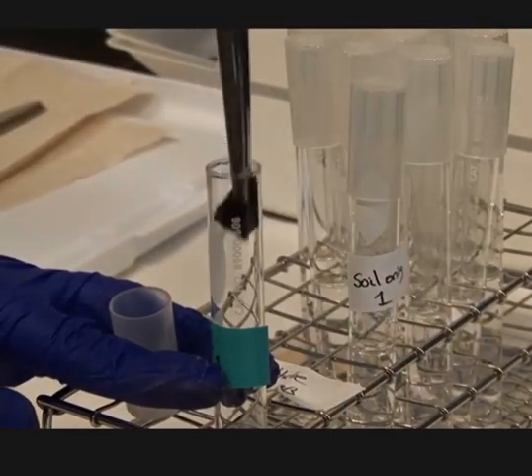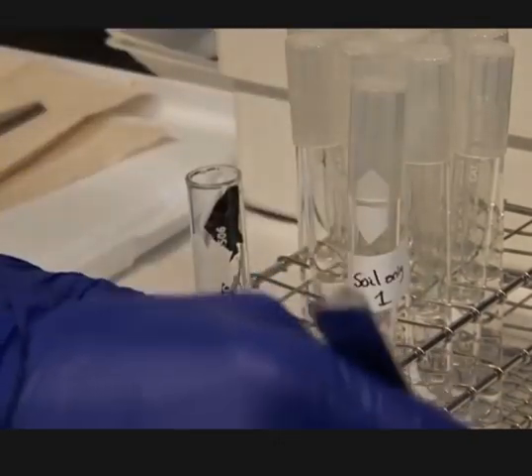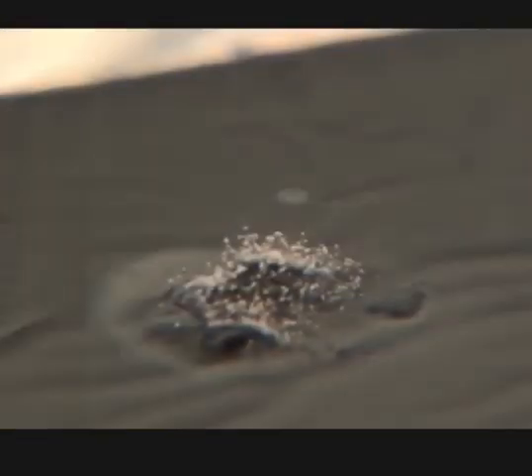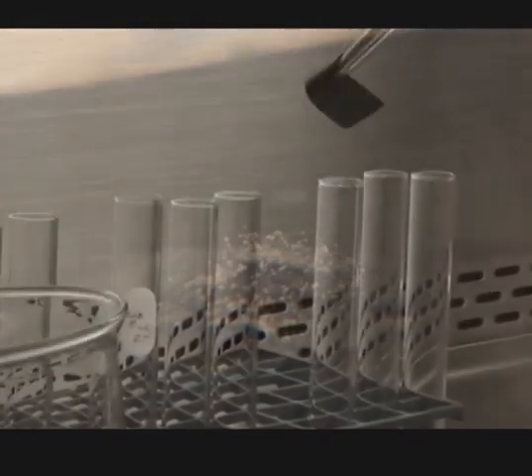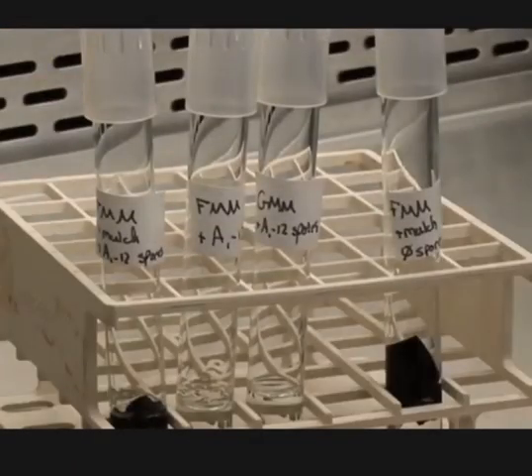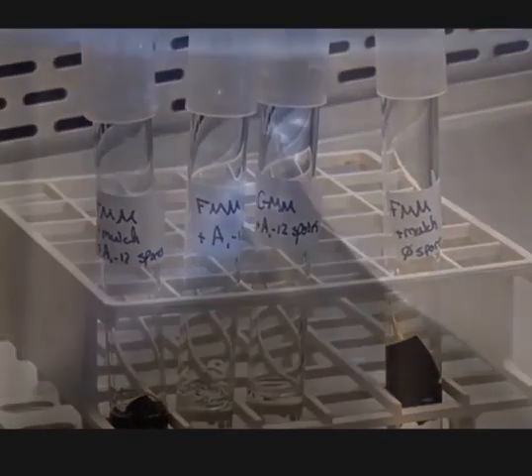Fungi were isolated from plastic films buried in soil for several months. The fungi were then tested individually for growth on plastic films. Plastic films were then incubated with the selected fungal strain with no growth media in order to observe direct degradation of the plastic by the fungi.